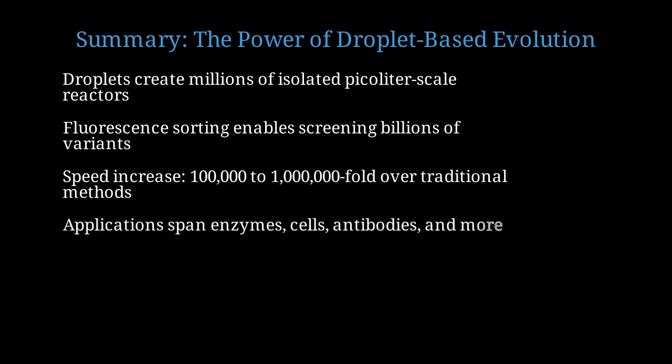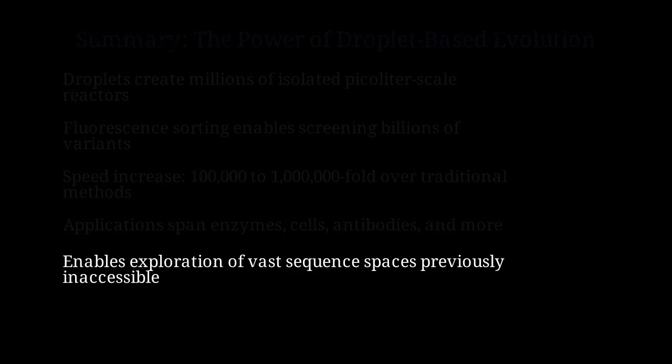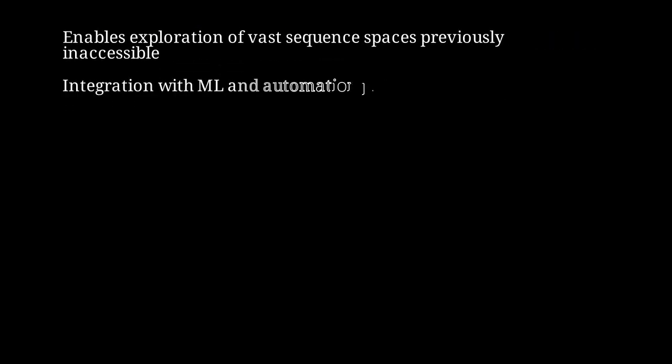Applications span enzyme evolution, whole cell engineering, antibody discovery, drug screening, and environmental bioremediation. The technology enables exploration of sequence spaces that were previously completely inaccessible, opening new frontiers in protein engineering. Integration with machine learning and laboratory automation promises even more revolutionary advances in the coming years.